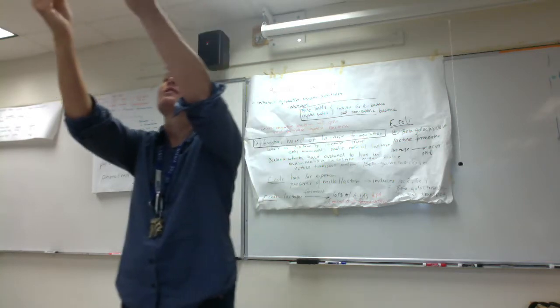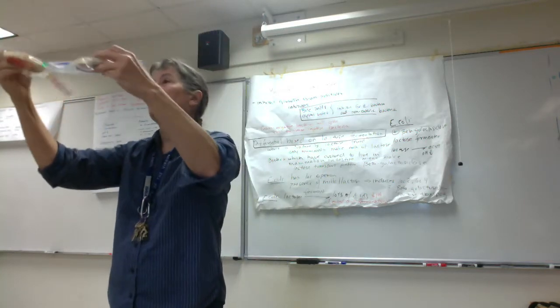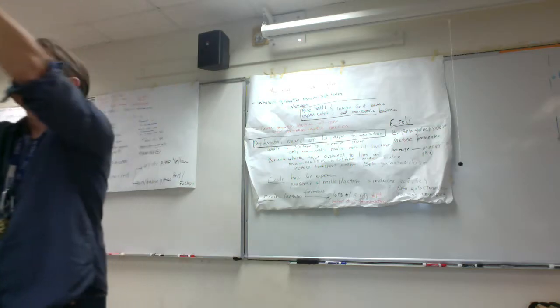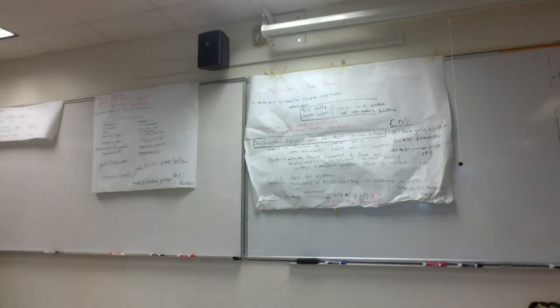But the reason, folks, that I was thinking I might have strep throat is, do you see on, again, folks, these are sample plates, and probably at that distance you can't see. But if you come up, you guys, and hold the plates up to the light, you'll see that there's areas of total clearing of the agar. So what kind of hemolysis is that? That's beta hemolysis, right? And so if it's a throat swab, we're thinking Streptococcus pyogenes.